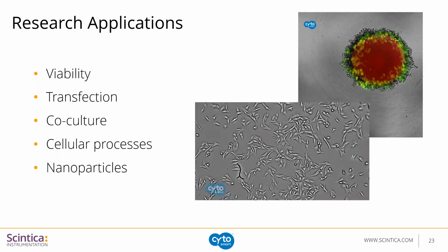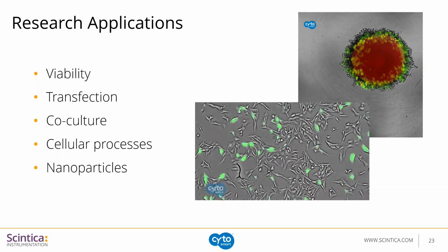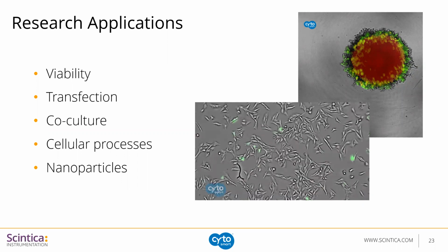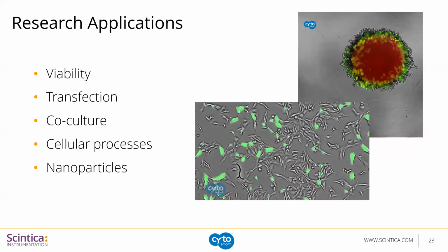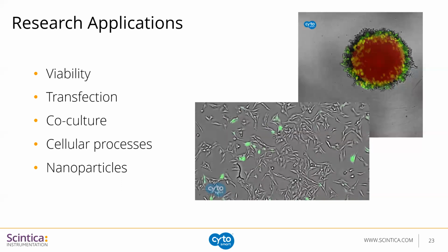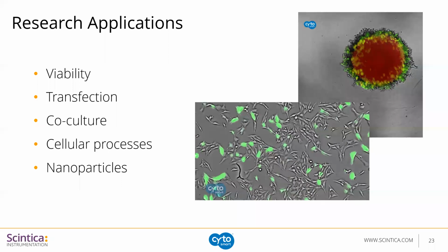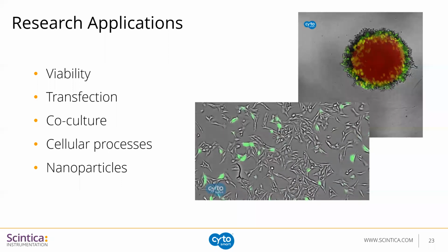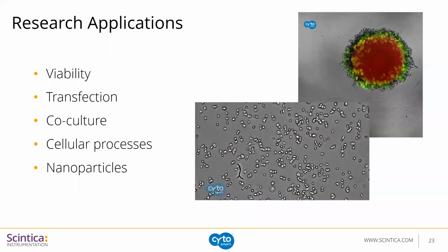Co-culture experiments. So maybe you want to label one cell population in red and a second in green and look at how these cells are interacting with each other. So this can be done maybe with cancer cells or immune cells or various populations of neurocells. A number of different cellular processes and nanoparticle work.